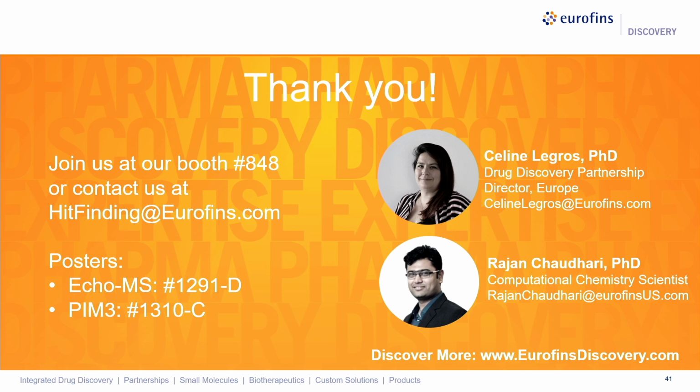One more question regarding the MS activity-based assay. You showed correlation comparing that to the ADP-Glo assay, but I'm wondering in general, can the MS activity-based assays be correlated with the assay for the compounds that were soluble? The correlation is a bit more spread than with the ADP-Glo because we have a bit more variability in mass spec, but it's still really coherent. I quickly showed it in the table, but the potency of the compounds is kept between the different assays, whatever the readout. But the cellular assay makes some disappear, because of the membrane and the solubility.